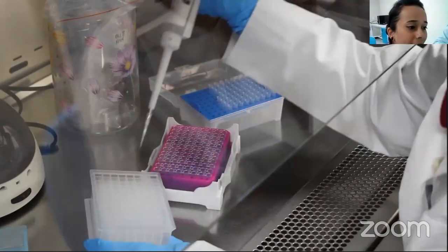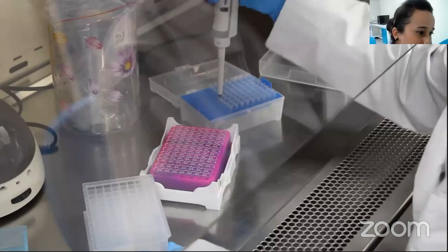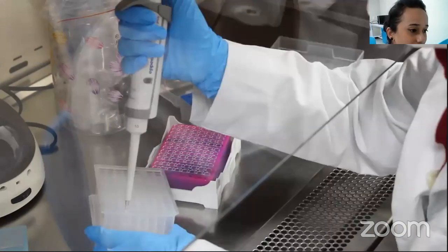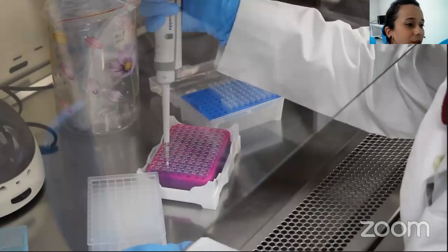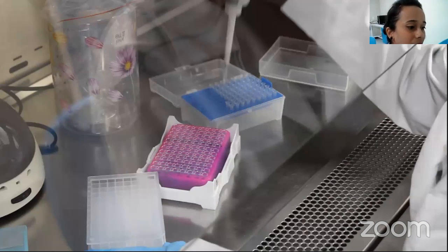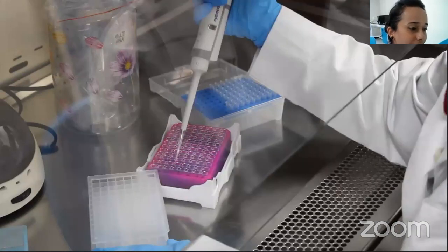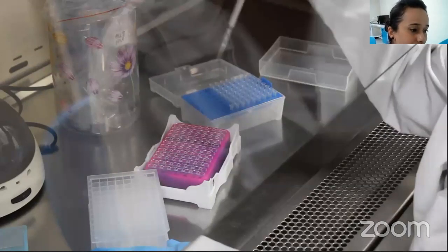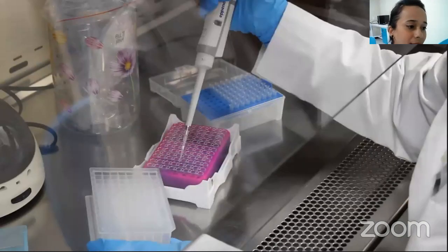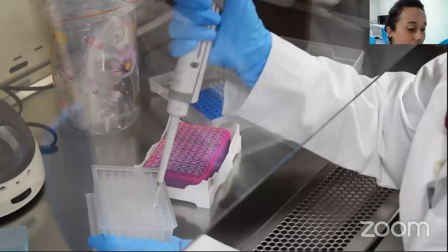Be very careful while adding the RNA samples into the well. The tip should not touch any adjacent or neighboring wells or the walls of the plate. Also change tips with every sample. The tips used should be filter tips or barrier tips. You should be slow and gentle while performing this step, to prevent any kind of contamination, accident or spill.